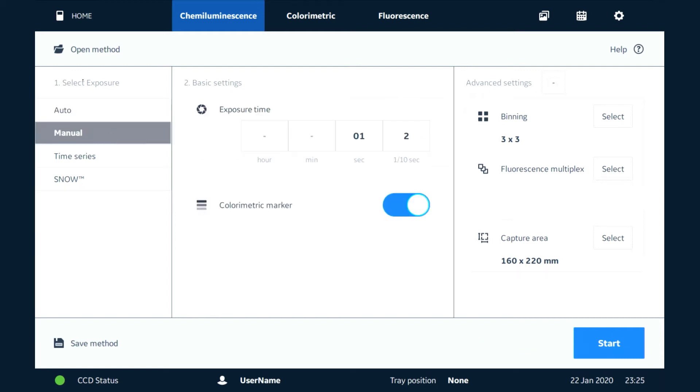We have manual mode where we can set the exposure time anywhere from 10 hours to a tenth of a second, and this is if you know something about the blot and what the expected exposure time would be.